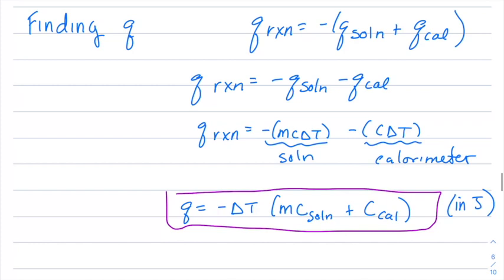All right, so now I want to go over your calculations for part 2. Dr. DA mentioned that the idea is that normally our Q of reaction equals the Q of solution, just with opposite signs. However, we have a calorimeter that is not perfect. It is a styrofoam cup, and we splurge on you guys. You know, only the best for our students. We give you 2 styrofoam cups. But that said, it's still a styrofoam cup. Just to let you know, we're not being cheap.